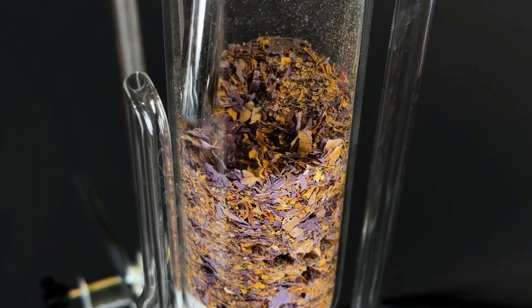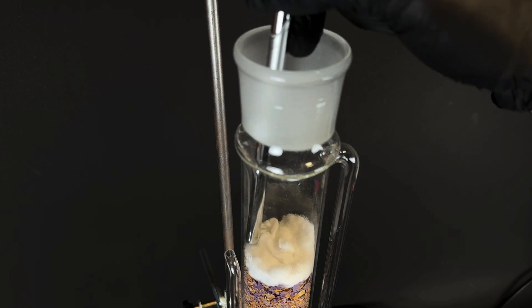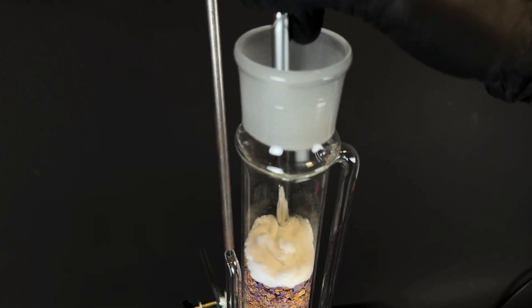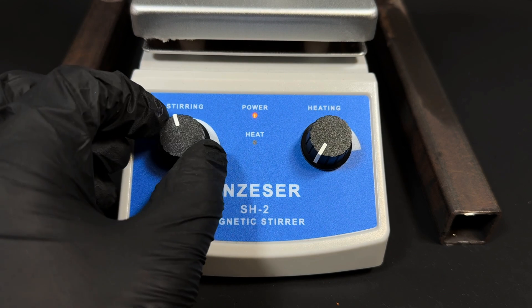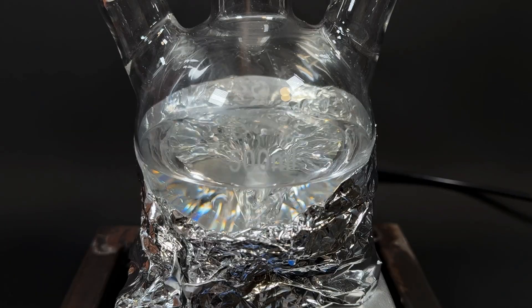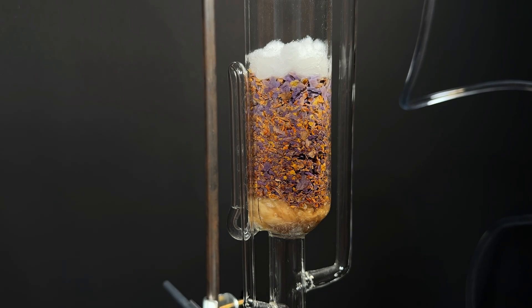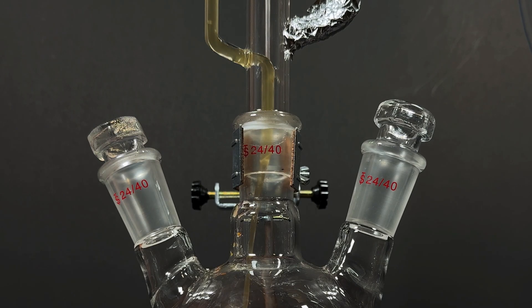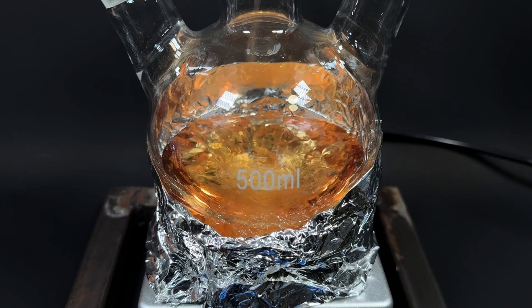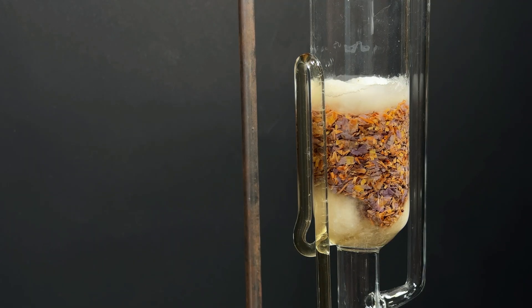Fill it with the ground lotus. My Soxhlet is on the smaller side, so I'll be splitting this into three batches. Add another layer of cotton wool on top to keep everything in place. Pour the food-grade ethanol into the flask and turn on the stirring and heating. The ethanol heats up, boils, evaporates, condenses, drips onto the plant material, extracts active compounds, and when the liquid level reaches its maximum, the siphon dumps the extract back into the flask. This cycle repeats over and over until the plant has given up all its good stuff.